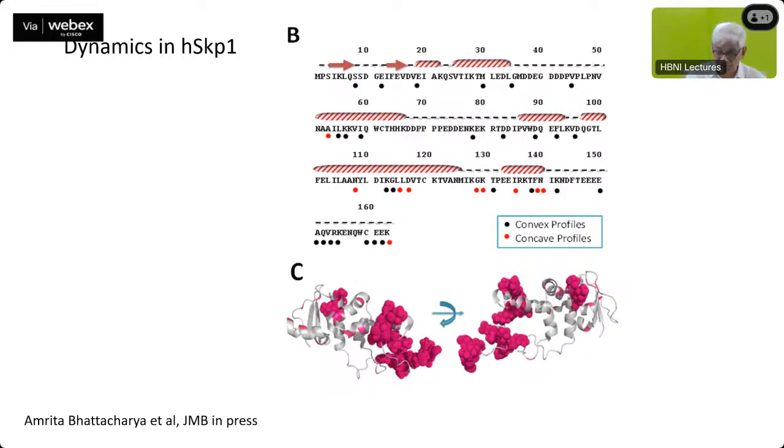This is the protein, and the data is already published. This protein has this sort of a structure. Here there is a small beta sheet stretch, and you have a helix, and there is a helix here, and a long loop here. There is a long helix here; see, this helix continues from here. And the loops are here, here, and here.